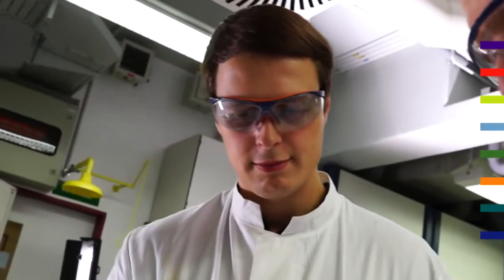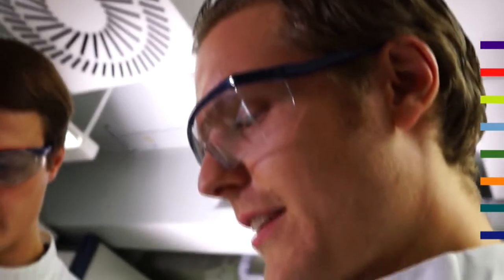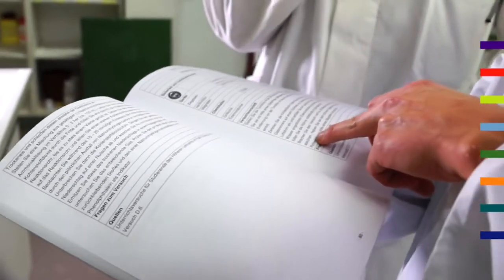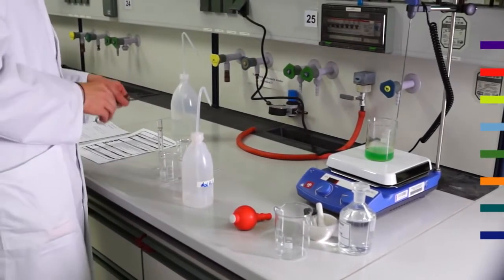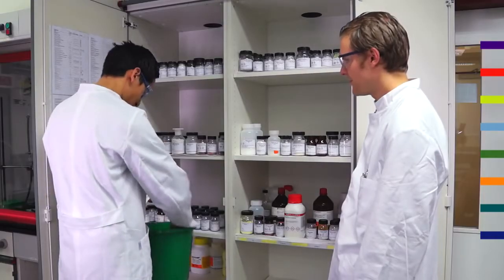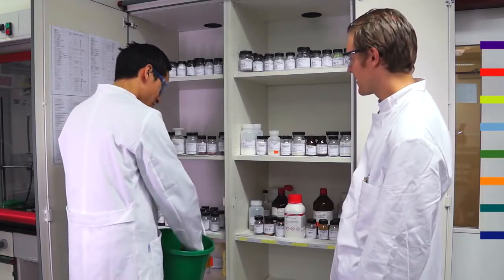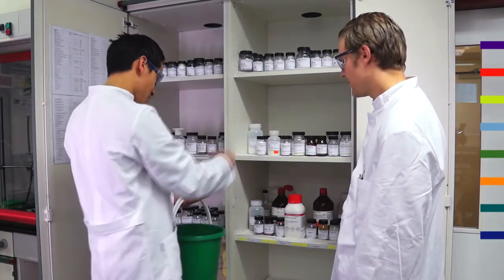Before you start an experiment, you must also consider if you have enough time for the entire experiment. If this is not the case, you must decide in advance at which point the experiment can be interrupted without danger. An experiment which needs to run for a longer period of time without supervision needs to be placed in the designated night labs. You must ensure that you have all reagents and equipment ready to use before starting an experiment. Having to search for missing items leads to a hectic rush and therefore to a higher safety risk, especially during difficult phases of an experiment.